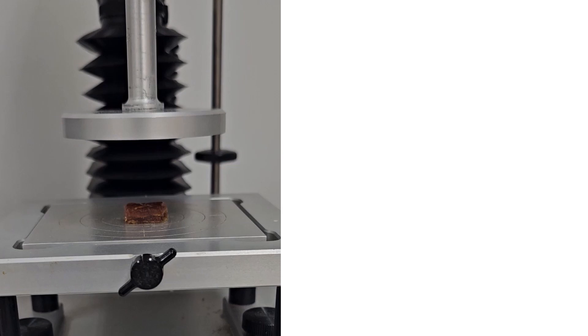I will explain how to measure fracturability, hardness, cohesiveness, adhesiveness, springiness, chewiness, gumminess, and resilience. In the first slide we have seen the two-cycle compression and decompression for apple cube. In this slide we could see the two-cycle compression and decompression of date fruit. Sample was placed on the center of the base table. We also need to set the experimental conditions in the TPA software.